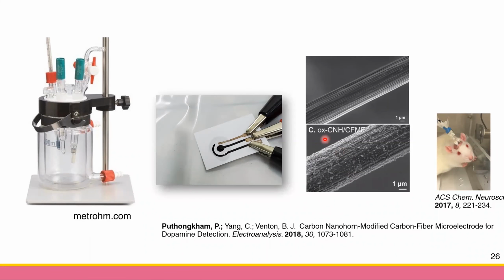Like here I put carbon nanohorn, which is kind of carbon nanoparticles on the carbon fiber, and it improves the properties of the electrodes. So this is like the actual application of the dynamic electrochemistry.